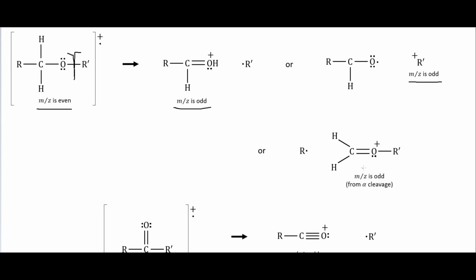And so we can also break it off over here. So we're breaking it off right here. That R group is coming off right there.